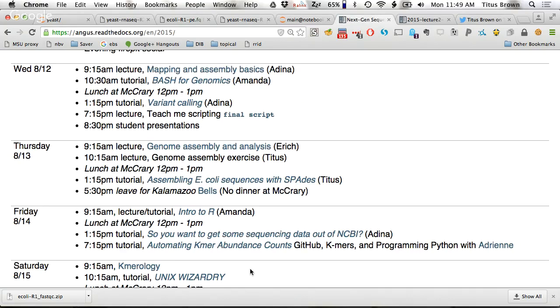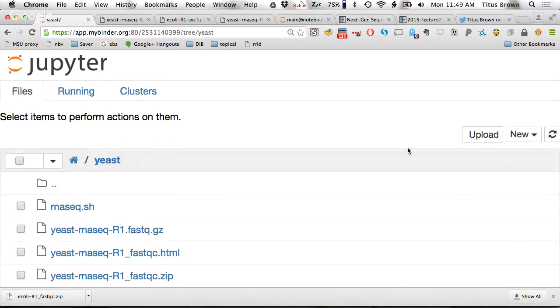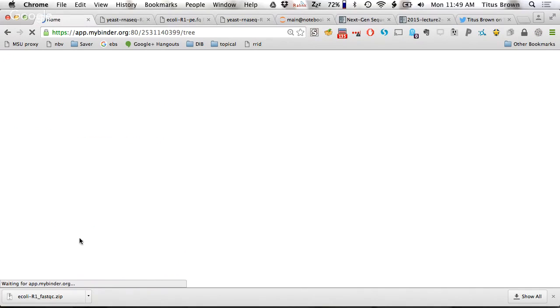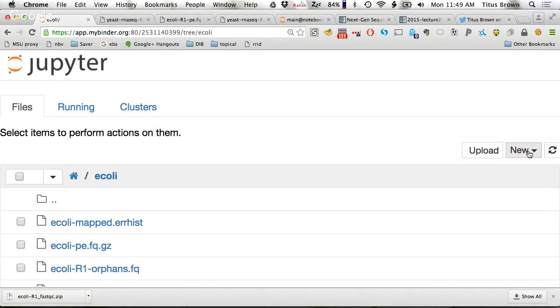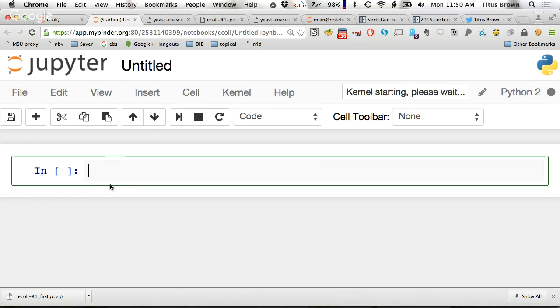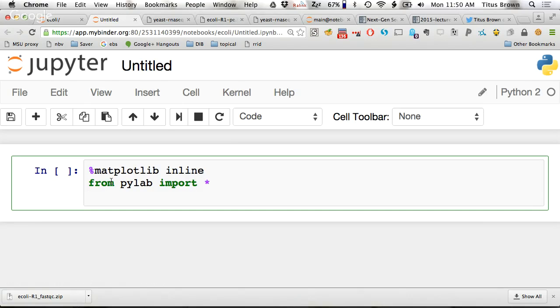So I'm going to show you something. You don't need to follow along. I'm going to do the equivalent of downloading this to Excel. Let me see. Was I doing this for yeast or was I doing this for E. coli? E. coli, right? If you go into the E. coli data directory, I'm going to actually do a graph. I'm going to use a Jupyter notebook to do a graph. You don't have to follow along, but I'll copy and paste this. This is now Python code, the Python programming language, where we're loading the data in and graphing it. We have other workshops on this type of stuff.